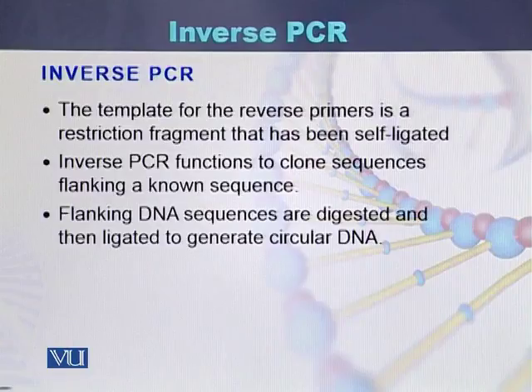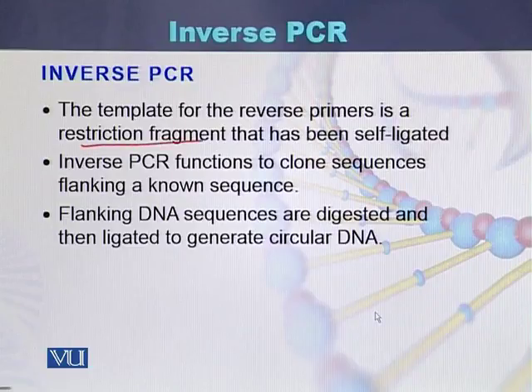The procedure of the inverse PCR, or the characteristics of the inverse PCR, are: in case of inverse PCR, the template for the reverse primer usually is a restriction fragment that has been self-ligated. Inverse PCR functions to clone sequences flanking a known sequence.